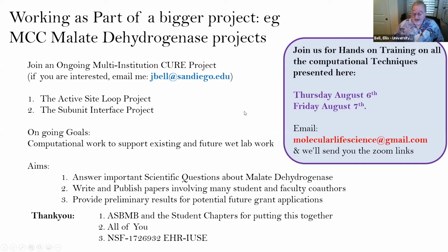So the final thing I want to say is that I teach based upon this thing called malate dehydrogenase, an enzyme everybody on this Zoom has heard about somewhere. This is the malate dehydrogenase CUREs community, which is the title of our NSF-funded program. Tony is going to talk about how you can adapt the techniques to other proteins easily.